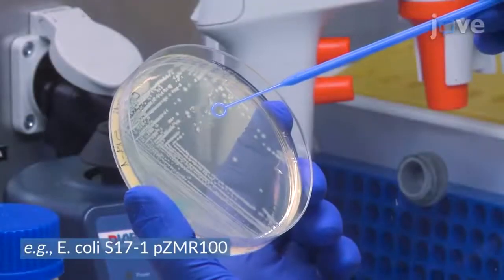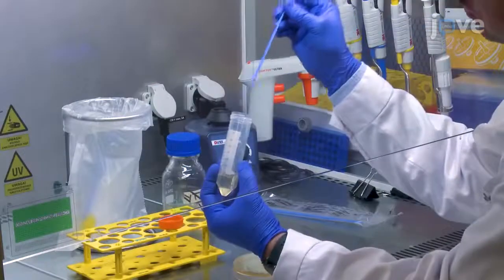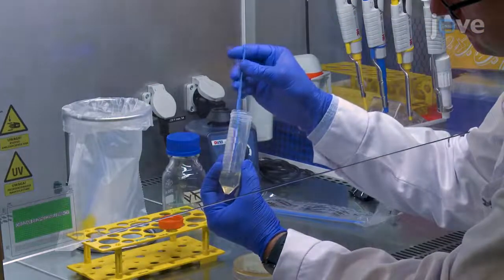To prepare the host cells, select a single colony from the host strain of interest and inoculate the bacteria in 10 ml of YT medium supplemented with antibiotics as needed.